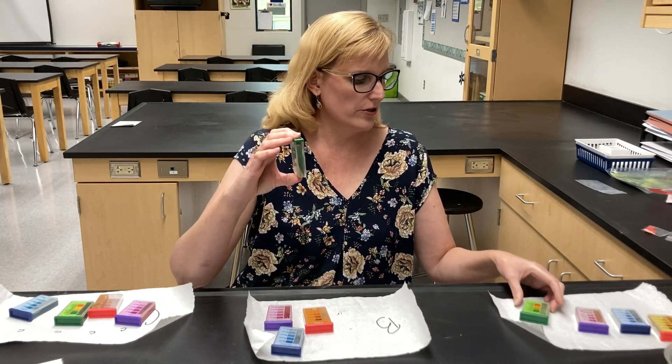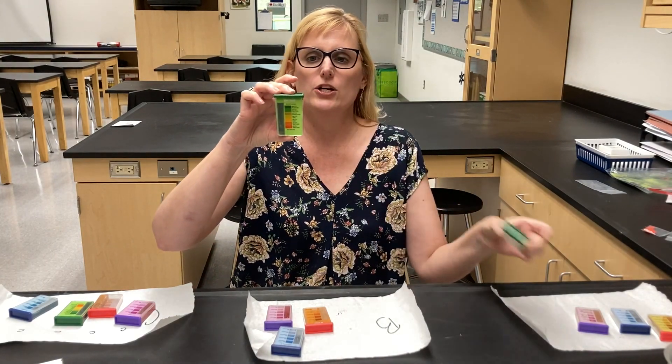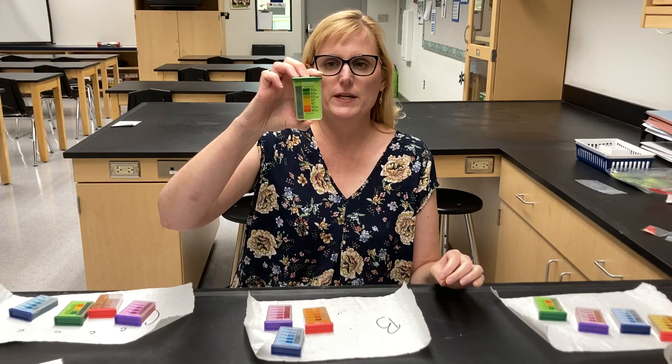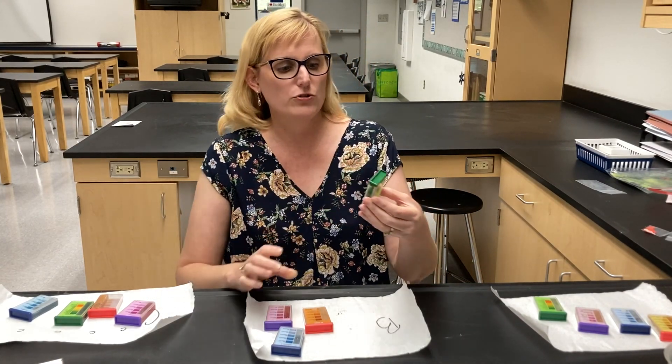This sample is a lighter color green than sample A, which is a darker green. It looks to be just about a pH of 7 to me, so pretty neutral.